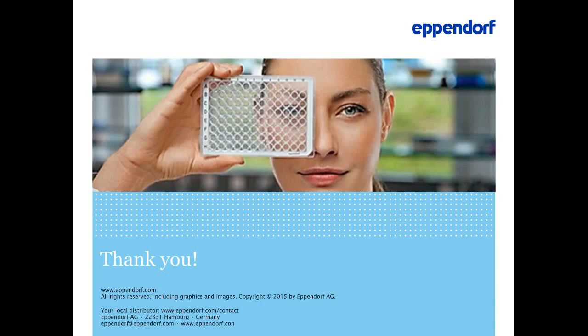Okay. In your slide 19, why are ssDNA 25 nucleotides incubated 30 minutes at 95 degrees centigrade? As we know, PCR heats the samples only 5 minutes at 95 degrees centigrade. Well, this is the experiment. These are conditions which are published, and this is actually to better visualize and make this more clear. You have to remember that in PCR the samples are heated for 5 minutes in this repetitive process.